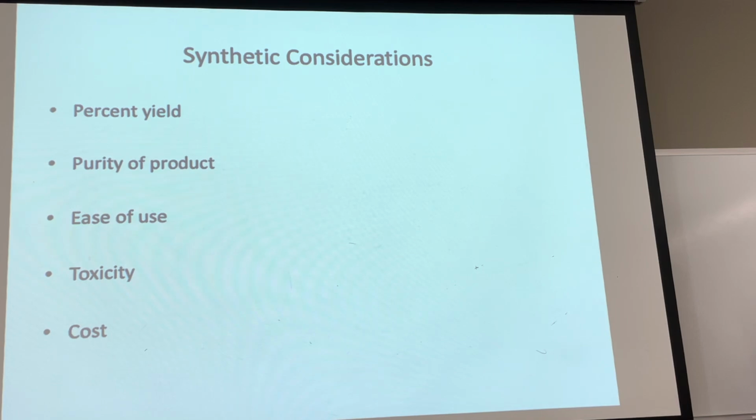This one's giving some product, but there's also a bunch of other garbage in here that I don't know what it is, but it's not what I want. So you don't need to analyze all the spectra, just be able to talk about the other spectra in a generalized sense. Okay, so I think that is all.